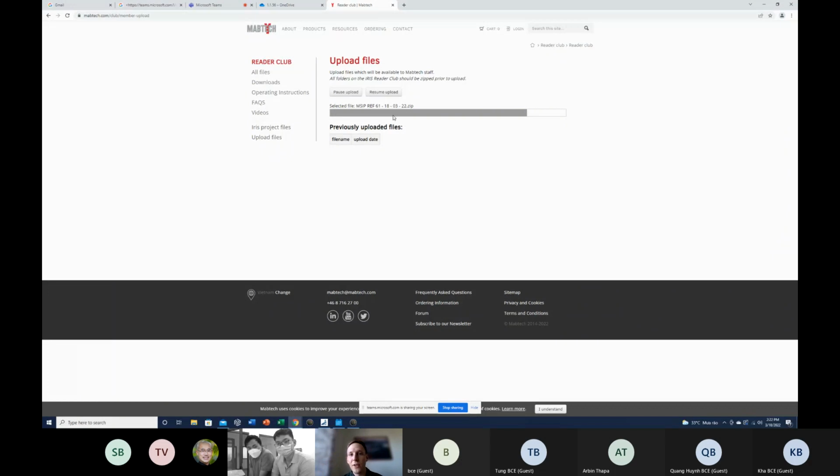That is basically the entire installation process. That is everything that is really required for the installation. You will have this recording so that you can go back and watch all the steps that we did. And that is the kind of information that we will need from you.